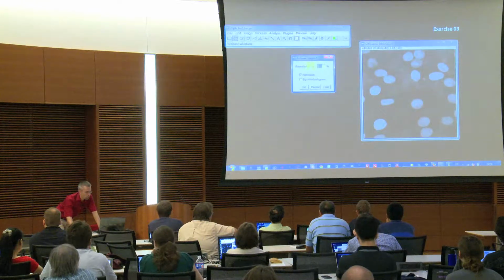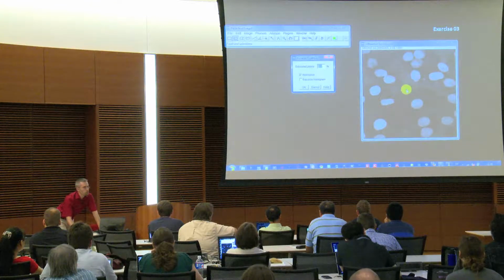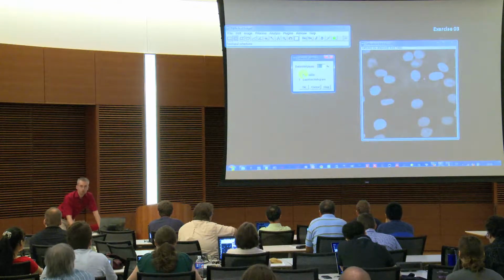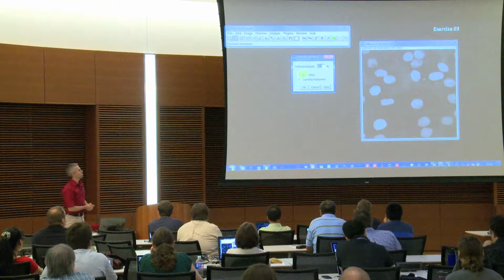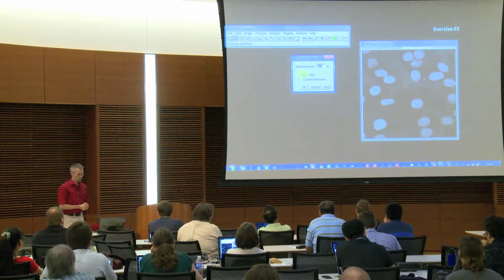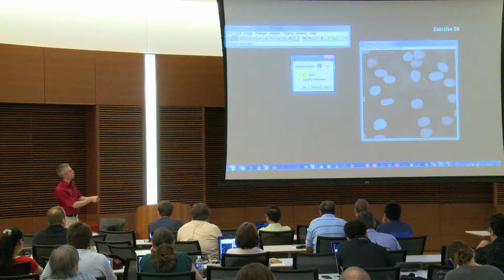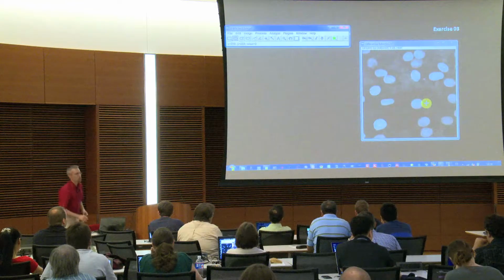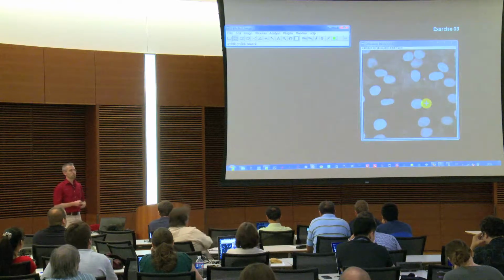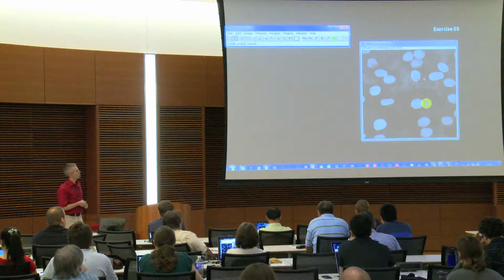What we do not want is to saturate pixels, otherwise our background comes up if we do so. What we want to do is a normalization, that is simply applying the normal contrast stretch to an image, as Ari has explained. So Process, Enhance Contrast, and then select no saturated pixels, so 0, and Normalize. If you apply that, you see that the contrast is increased a little bit to the maximum, avoiding any kind of oversaturation.